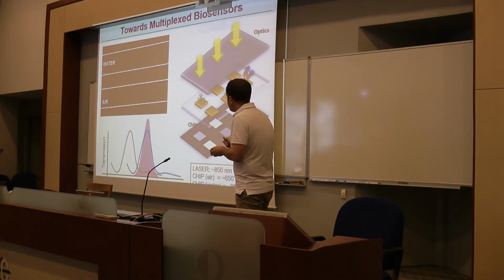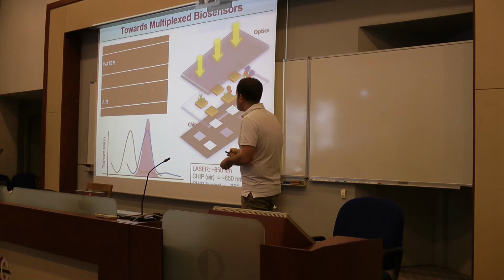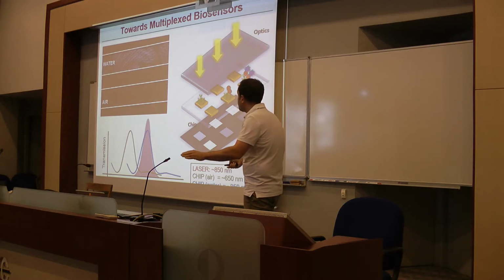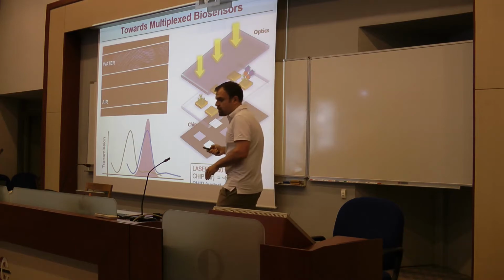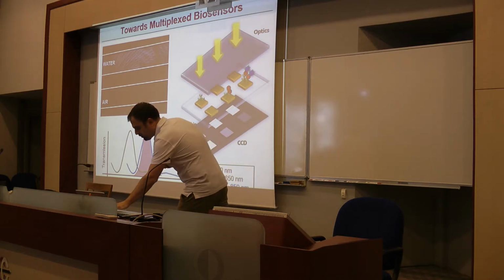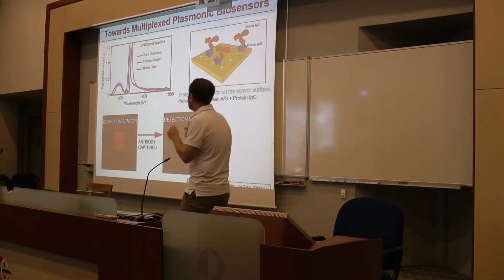In this figure I have a fluidic nanohole chip integrated to a 2-channel microfluidic chamber. Now the 2-channel is filled with air, so the EOT signal and the laser source do not match. Since we don't have any match, you see a black spot on the CMOS camera. So I will flush water in one of the chambers. Now I am shifting the EOT to a longer wavelength, so the EOT signal allows much more photons to pass through it. So you have a bright spot on the CMOS camera. So it's like an on and off. When you have something on the chip, you see a light intensity change. This is a simple example of how we can use this phenomenon for biodetection.